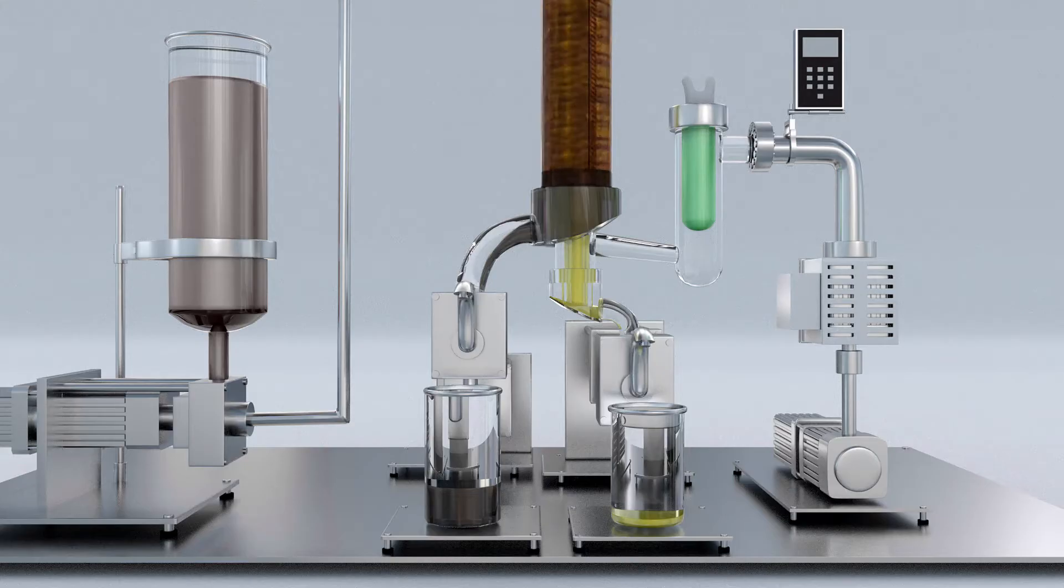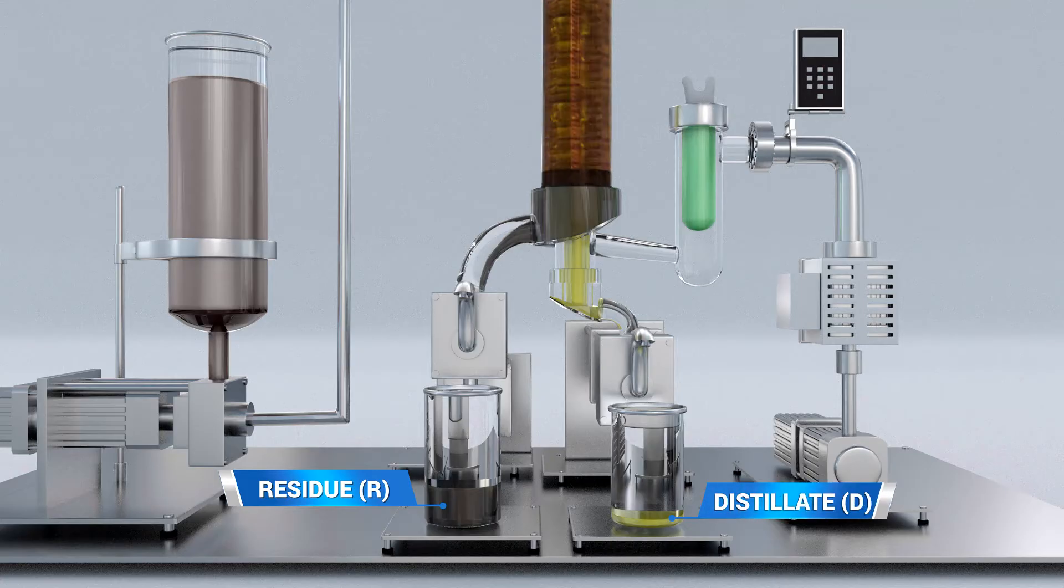Following distillation, the oil is divided into two fractions known as the residue and the distillate phases. The distillate phase contains valuable cannabinoids rich in THC or CBD, while the residue phase contains impurities and other undesirable high molecular weight byproducts.